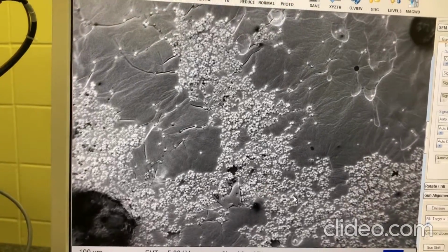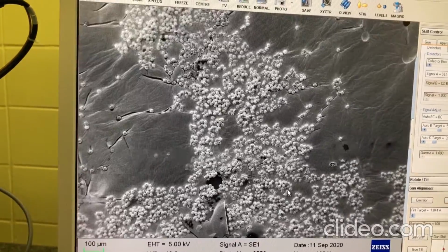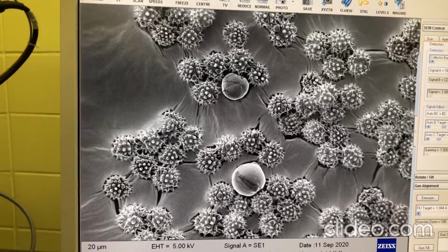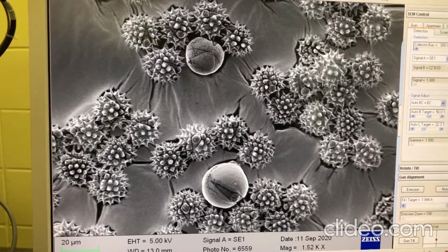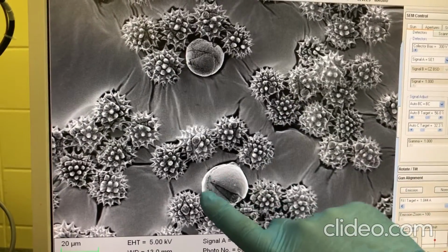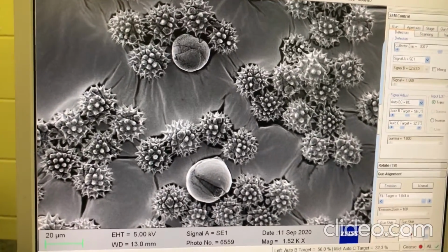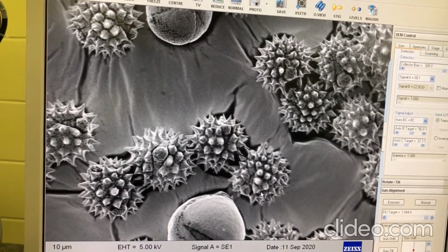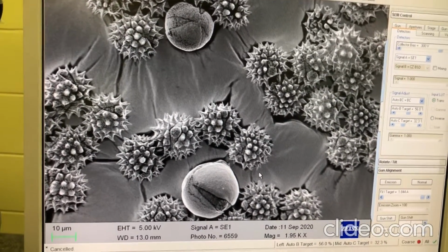All right, for our second sample, we have something that's a little bit smaller than a tick. What we have on here is actually a sample of pollen, all right? Now, pollen is produced by all flowering plants. It's part of their reproductive system. All right, and as you can see, as we zoom in on it, there are actually two kinds of pollen here. There's this one that's a little spiky ball, and there's this one that's a little bit more round. So different kinds of plants will make different shaped pollen. And pollen is also what makes us have allergies, and it's also that yellow coating that we see on our cars in the springtime. All right, and it's quite a bit smaller than a tick.